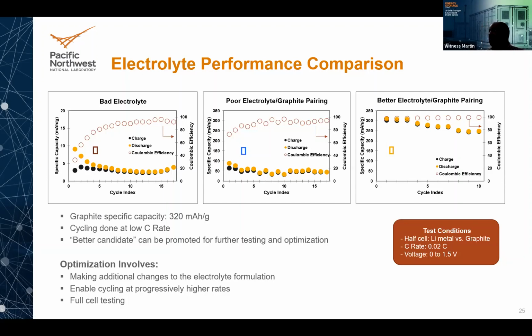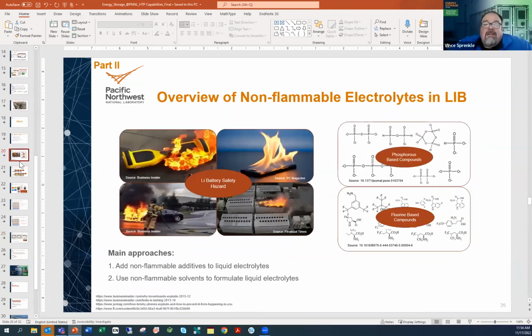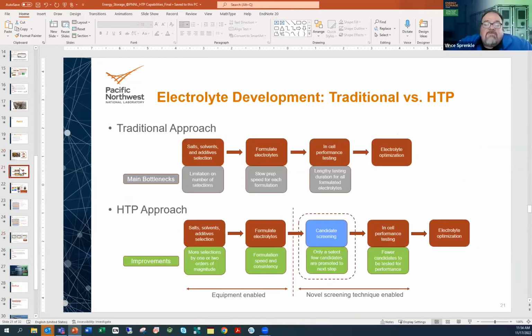Okay. Yeah. I did want to take a step back. You showed two different approaches towards going after this. A lot of it worked with the electrolyte formulation that we're looking at and a property, like looking at solubility or something else, but I think in an earlier slide you mentioned the possibility of doing CV curves combined with high throughput. What else can you do with this system that expands it? I know, Witness, in yours you were taking the samples out and doing coin cells. Is there potential to move that into the high throughput system and expand the property measurements that we're looking at now?